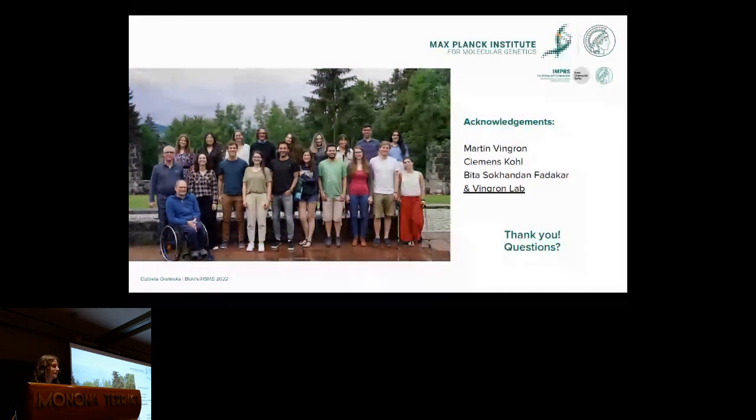Hi, I had a question about the inputs to your APL package. Is it like a Seurat object, or what is it? Yes, first of all, we can use just the input matrix, in the sense that this is the table of cells and the genes. We can also use the Seurat object or a single cell object. Thanks.